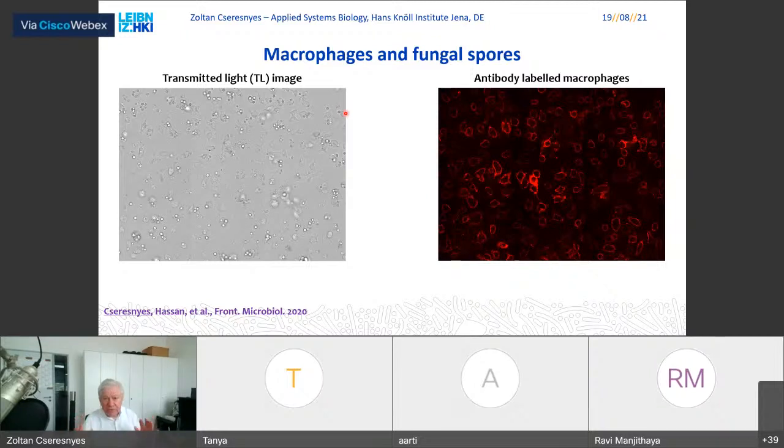So our examples today will come from such an experiment where we used alveolar macrophages, sometimes we call them MHS cells, and this is what you see in this image. The little round things, which are in the contrast somewhat brighter, sometimes darker, these are the actual fungi. Okay, this is Aspergillus fumigatus added directly to a petri dish, just like I showed you a few slides ago. And then we took an image of it. This is actually an image of 3x3 positions, so it's a total of 9 images. The reason for that is that we wanted to have enough cells in the field of view so we can get statistically reliable results.